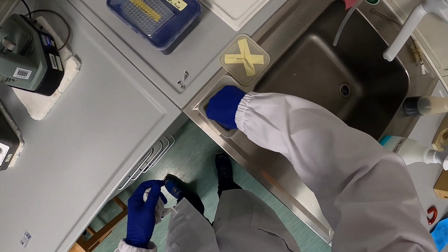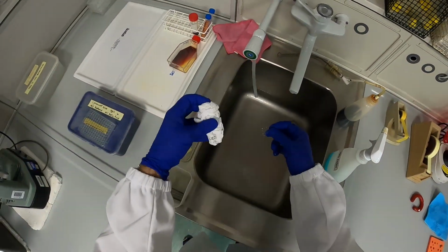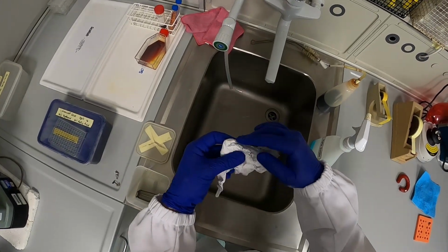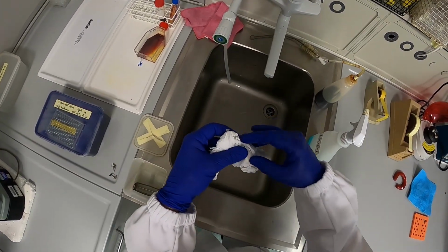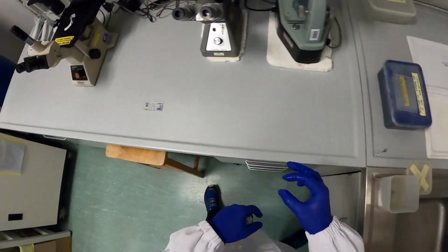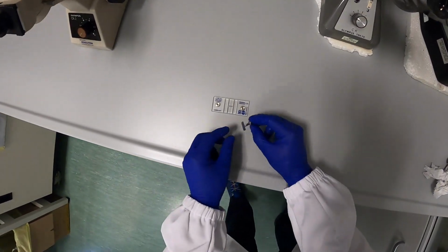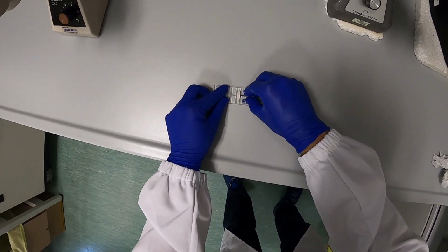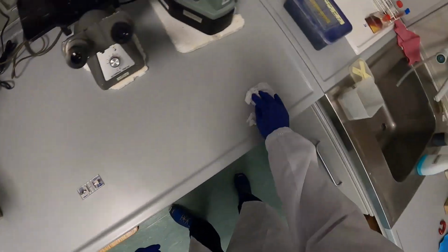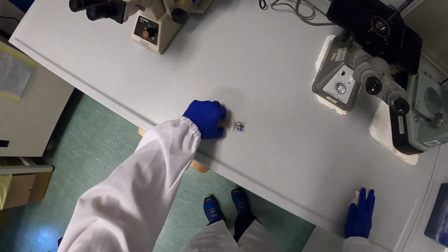And then we need to fish out a little glass cover slip, which is actually thicker than the one you normally use to make microscopic slides. And even though this is thicker, you still have to be careful because it's very easily broken. But it needs to be very straight, and that's why it's so thick. And in order to not lose it, we use these metal clips that keep it in place, just for convenience. Okay, everything clean and dry. Let's put away the box, and it's ready to be used.